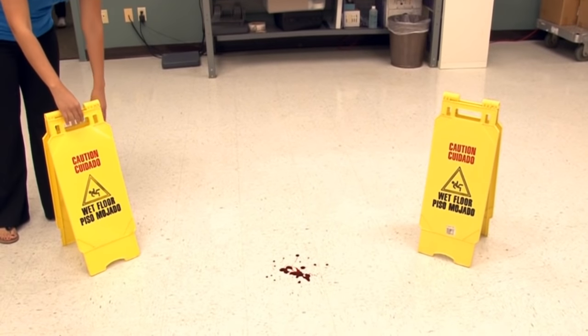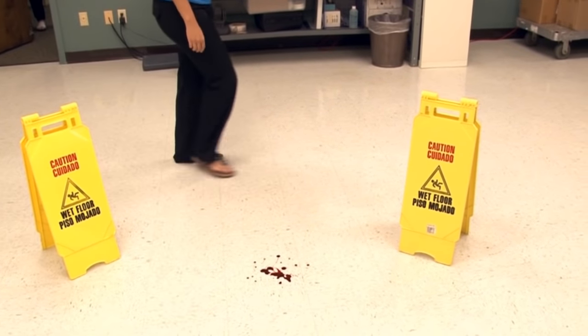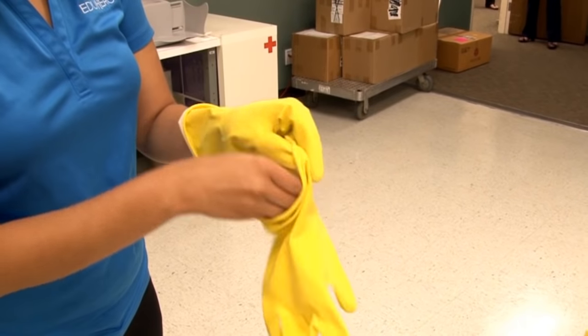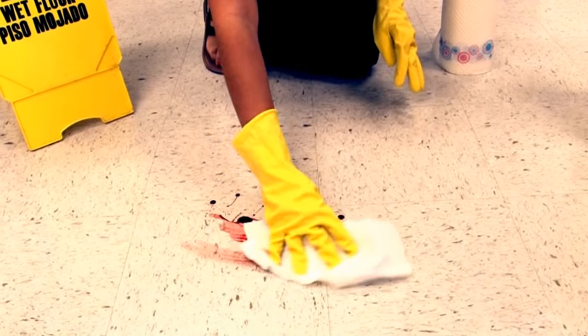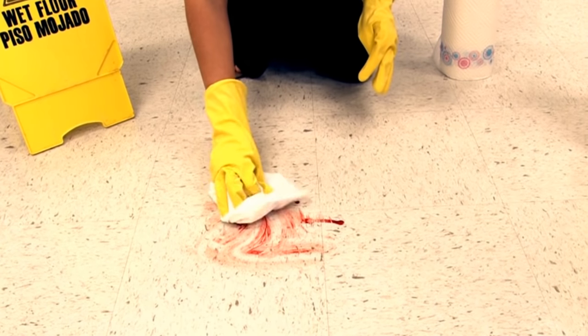First, make sure you block the spill area off so no one else can get near it while you are cleaning it up. Next, put on a pair of gloves. Using the paper towels, wipe up as much of the spilled blood as you can.